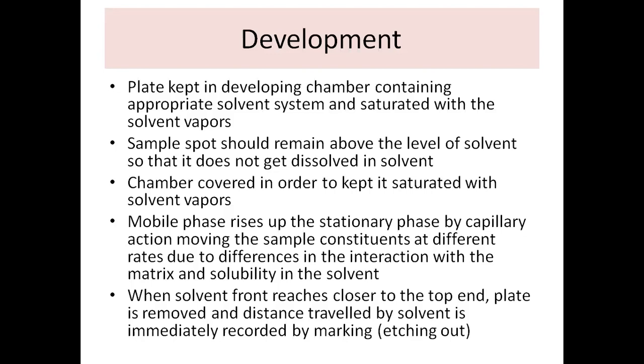Now, when you are placing the plate, you should always ensure that the sample spot does not get dipped in the solvent system. Because if the spot itself dips in the solvent system, then what will happen? The sample will get dissolved in the solvent. So that should not happen. The level of the solvent system must be below the level of the spot. Is that clear?